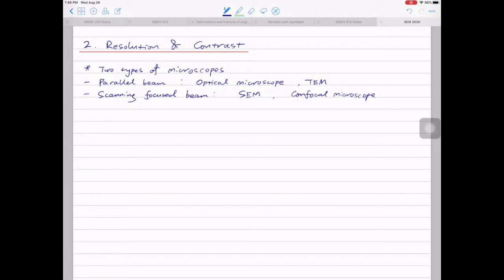I also heard from Zoom saying parallel. If you want to do in situ work in an SEM, you have to consider the time lag. So when you deform the specimen, or some chemical reaction is happening, maybe the top half has already completed the chemical reaction or the deformation, but the bottom half hasn't been scanned yet.